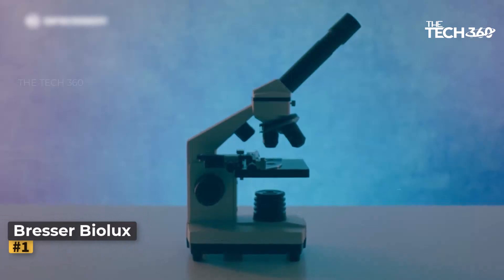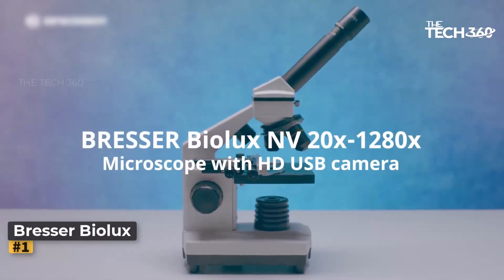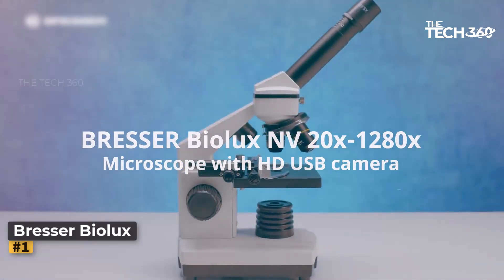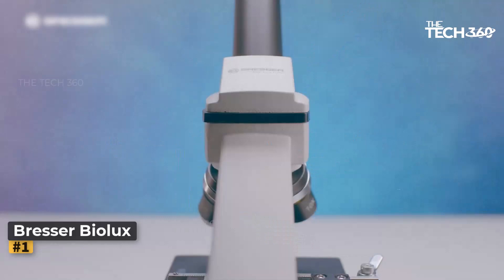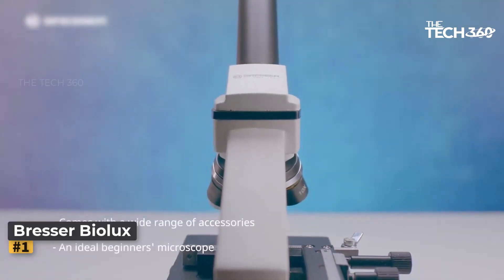Number 1: Bresser BioLux NV 20X-1280X. The Bresser BioLux NV is the perfect microscope for beginners. It comes with a range of accessories, including an LED lamp with adjustable brightness, a filter wheel with 5 colors, and various filters.